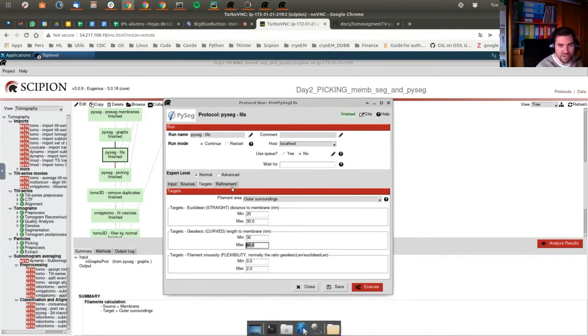You have a gray image. Yeah, you have to click on the boxes which are down. Click, for example, in the first one. Try to click the graphs one, which is the third, beginning from the top, from the bottom left corner. Maybe it takes a little bit long if the graphs.